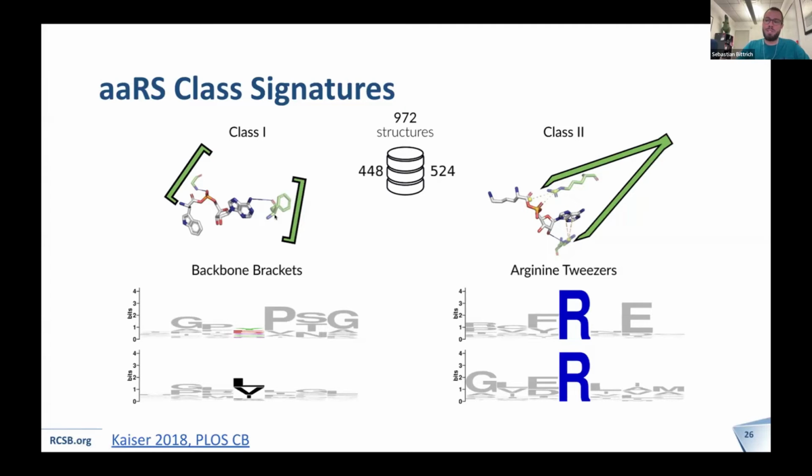And that's because the side chain of those amino acids doesn't really matter. So you can see side chains pointing away in this rendering. And rather, there are really generic hydrogen bonds formed by the backbone atoms of those amino acids. And virtually any amino acid can form them. Maybe proline would be a bit weird, but generally speaking, all amino acids are welcome here and can participate in those generic hydrogen bonds formed by the backbone atoms.